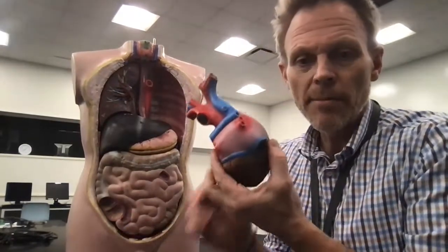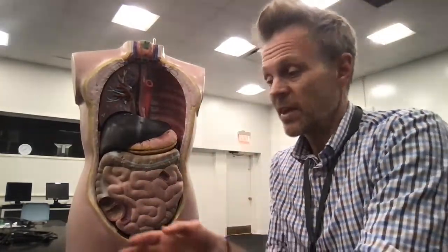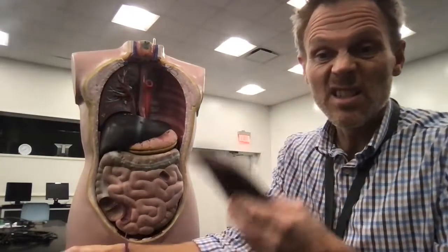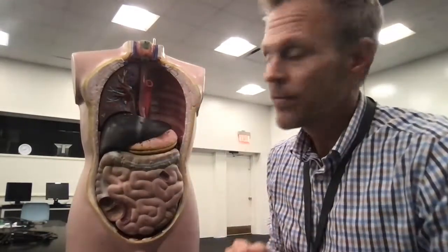Hey, everybody. I brought in a guest speaker — probably not going to say much, so I'll speak for him. I removed some of the parts: we took the heart out, took out some lungs, just so we can see better. So this is a little bit empty.